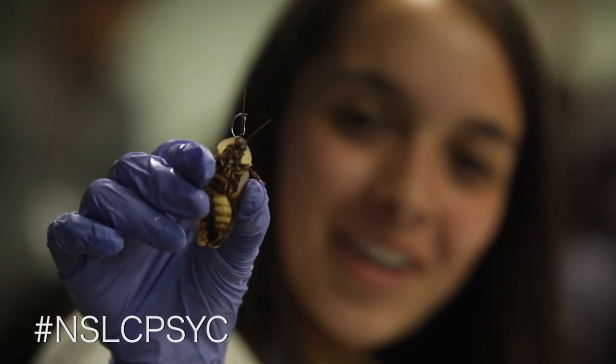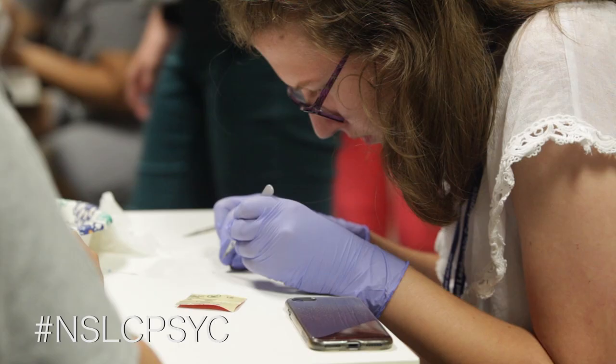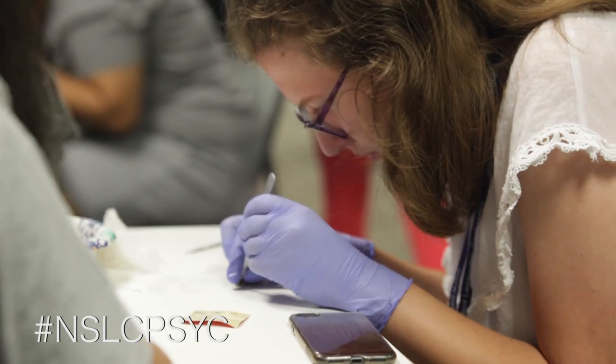I've never gotten this much hands-on experience, especially within my psychology classes — I've never really done any labs like this. Most of the time it's just lecture and note-taking. This is probably one of the first hands-on experiences I've had, especially with neuroscience.